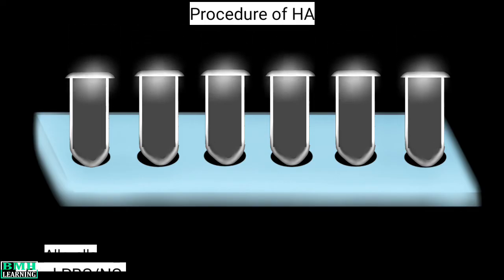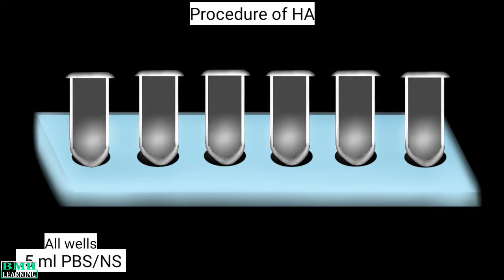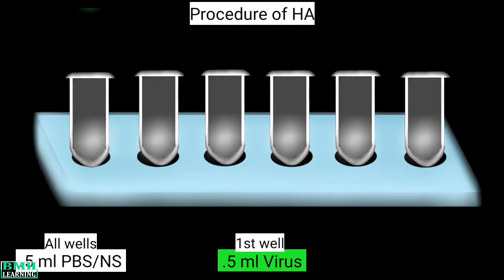First, we take a microtiter plate and place microwells in the tray. We add 0.5 ml of normal saline to all wells. After this, we add 0.5 ml of the sample containing virus to the first well.